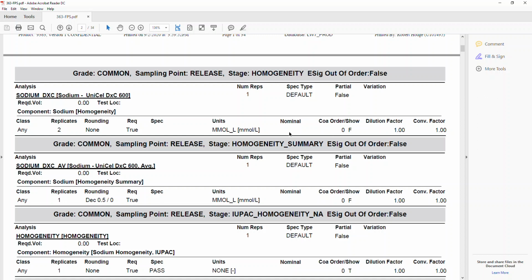But that doesn't necessarily mean that that is what the specification is requiring for that level of accuracy. So if it says 10.00, that level of accuracy for the specification may only be 10 to the ones place.